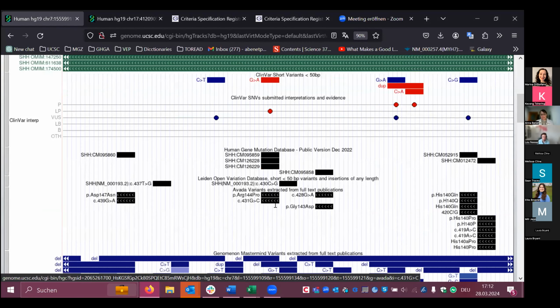So we went through all these positions here. This is the beginning of the exon, this is the end of the exon, and this is the intron part, the intron variants. These are the positions here. You see here -1 and -2, which are the last positions of the exon in this case. And we applied the codes that are given in this table. The codes are here, so it was a little bit complex to transform this data, but the data is very well represented and very understandable in this table.